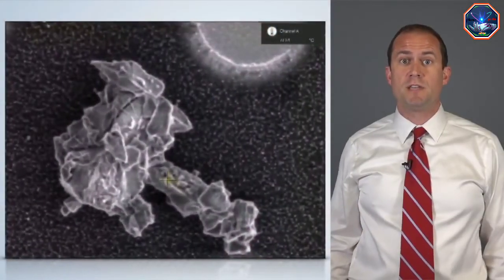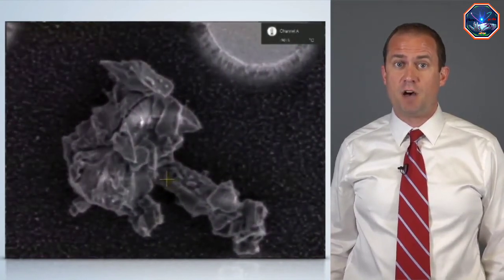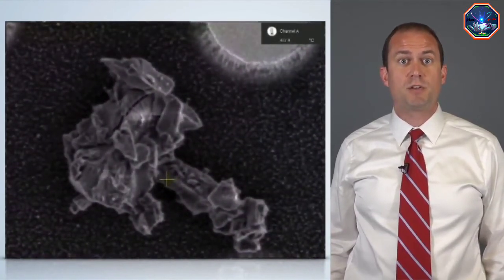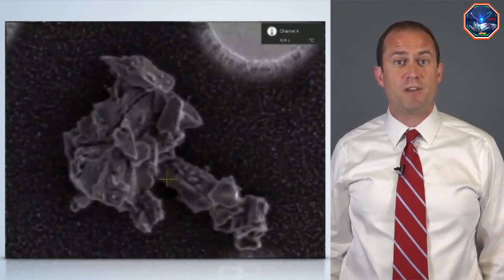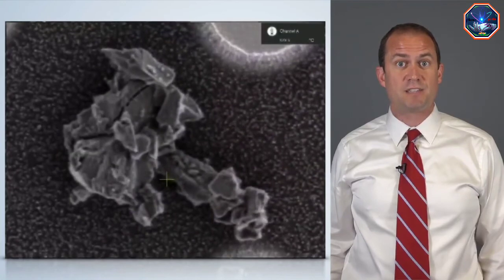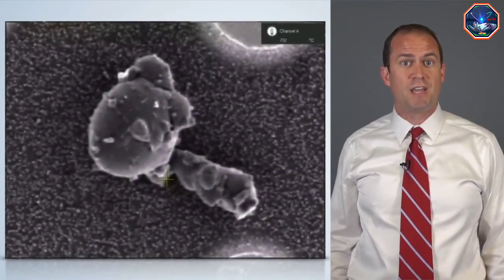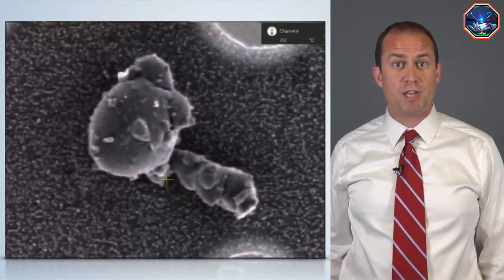temperature, or radiation. For instance, in this video, we see a live SEM feed of a piece of glass frit on a special stage that can heat up to very high temperatures within the microscope. Once the glass heats up to its melting point, we can see how the particle changes as a result of the temperature change. In the realm of nanomeasurement, there are so many tools available to help us uncover information about the world around us.